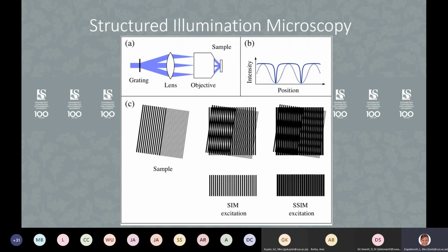You can see there's stripes on this side that are quite defined, and then there are these finer patterns on this side where your sample already has finer structures. So you have new patterns. If you put a different type of grating over, the pattern changes slightly and you get a different pattern. These patterns we call Moire Fringes.